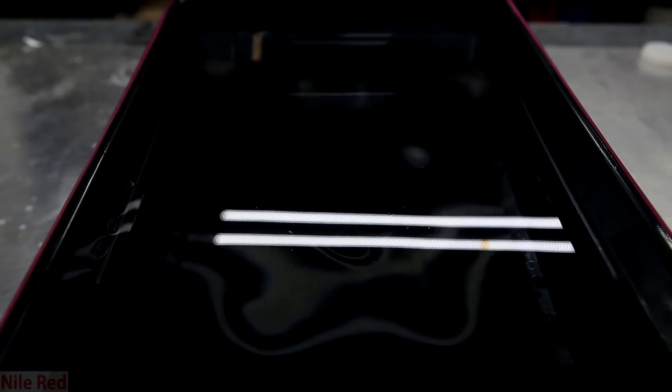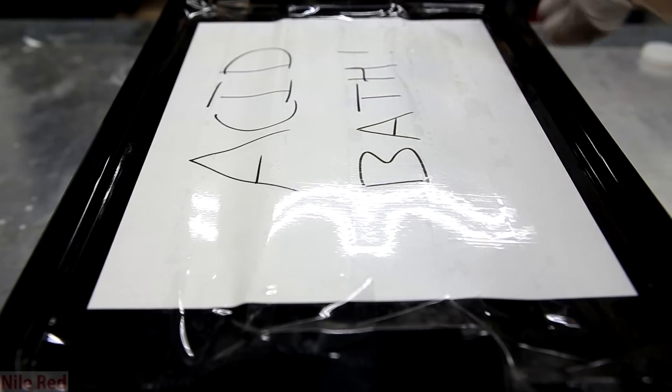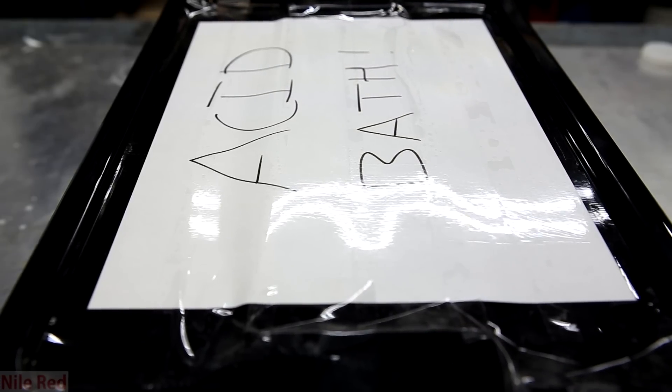Once it's all been added I place the lid on top which was labeled appropriately with acid bath and an exclamation mark to indicate that it's dangerous. Also you might notice that there's some purple electrical tape wrapped around the bin, and I use this to make the lid seal better.